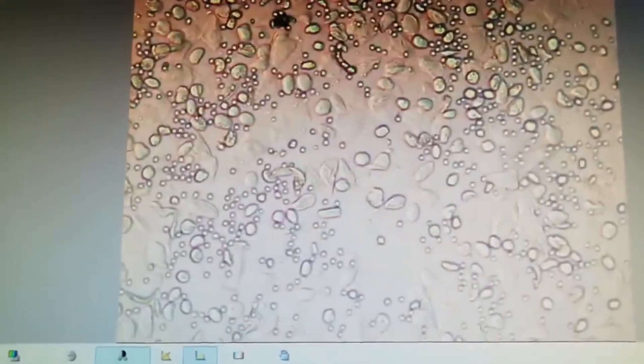Now on screen it is showing metestrus phase. You can see the cornified cells and leukocytes are in a mixture, forming a horizontal layer. It is a metestrus phase.